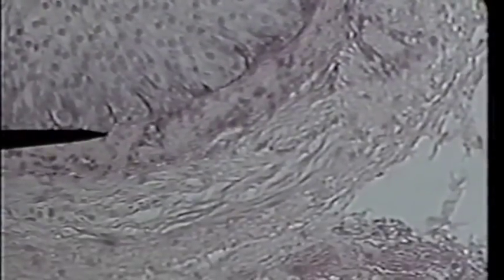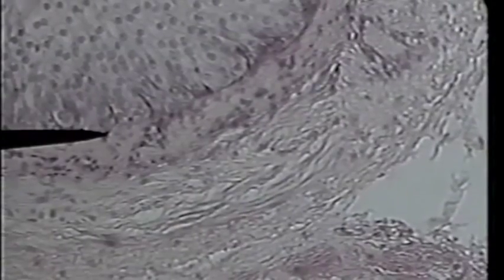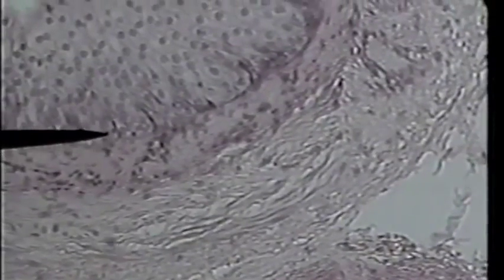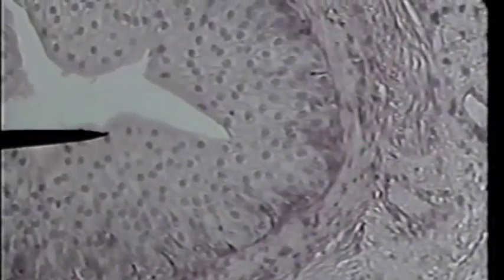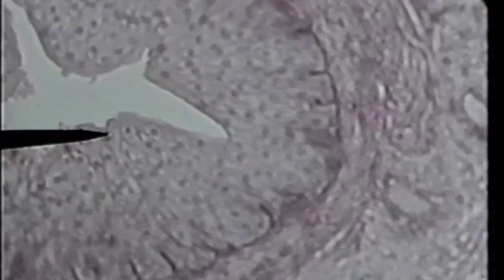If you'll note, transitional epithelium is actually stratified. There are many layers of cells. This would be about where the basement lamina is. From here to the lumen is the transitional epithelium. However, all transitional epithelium is stratified, so we can just simply call it transitional epithelium.